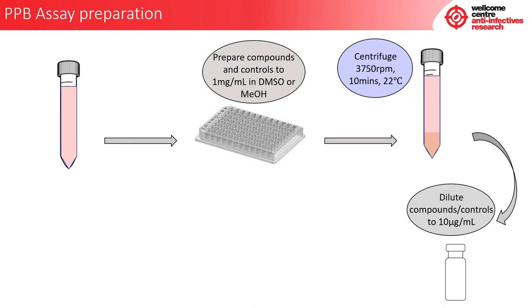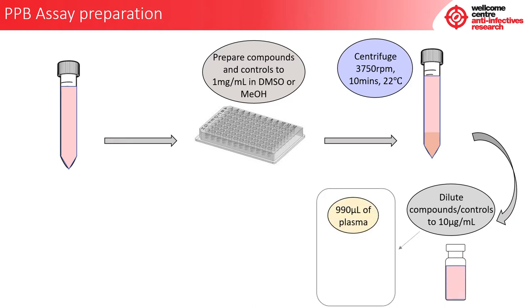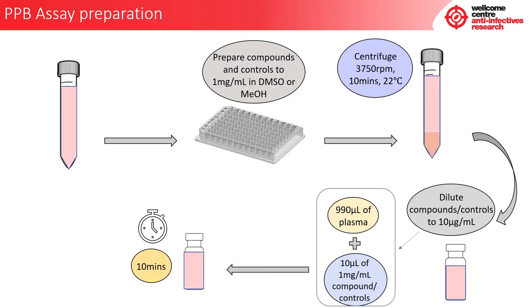Next, we are going to dilute our compounds and controls to 10 micrograms per ml. To do this, take out as many 7 ml vials as needed — for example, if we have 6 compounds and controls in total, we will need 6 vials labelled 1 to 6. Add 990 microlitres of supernatant plasma to each vial, then add 10 microlitres of our 1 mg per ml compounds or controls to the relevant vials — for example, compound 1 goes into vial 1 and so forth. These vials will then be left on the bench for 10 minutes to equilibrate.